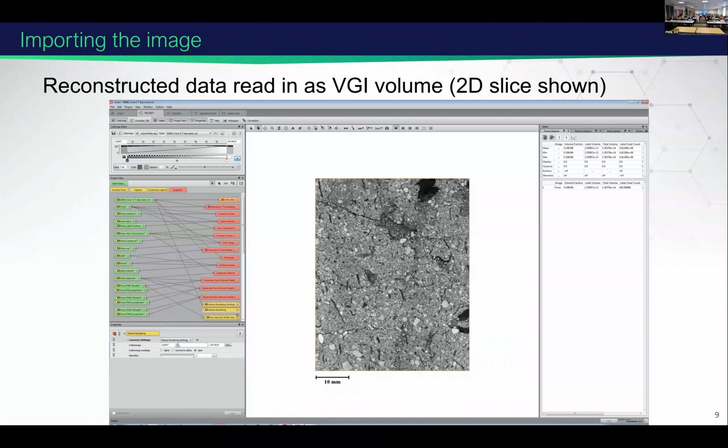Here, this data is after cropping, as I said, because the cropping gives you precise information from the soil and the region of interest that we are mainly interested in to get more information about the pores. While packing the soil into the column, there is a kind of false porosity, because of the gap between the column and the soil, which will influence the pore characteristics and other porosity values. So this is not the actual porosity of the soil. We avoid all those details and get only the more precise information, such as porosity and other pore characteristics, like volume, area, diameter, and those details.